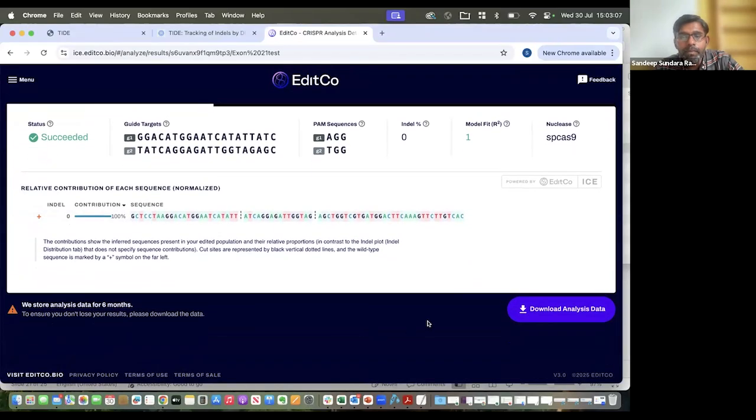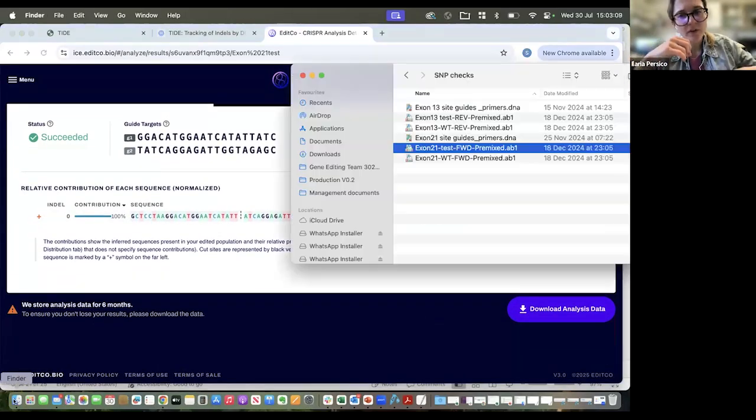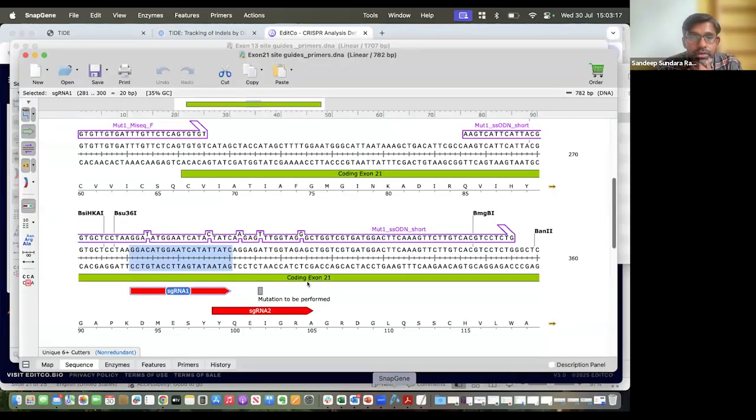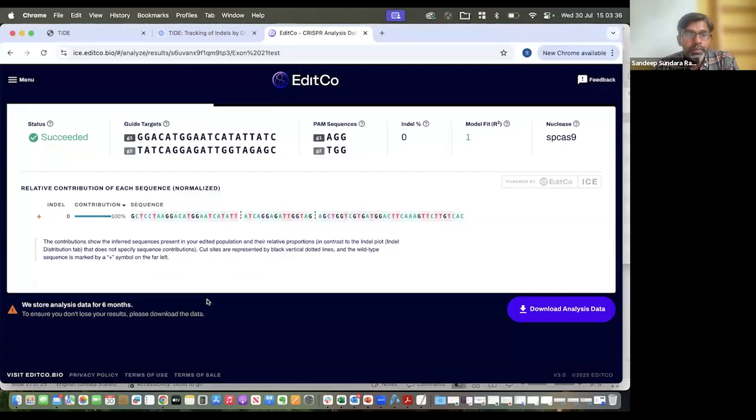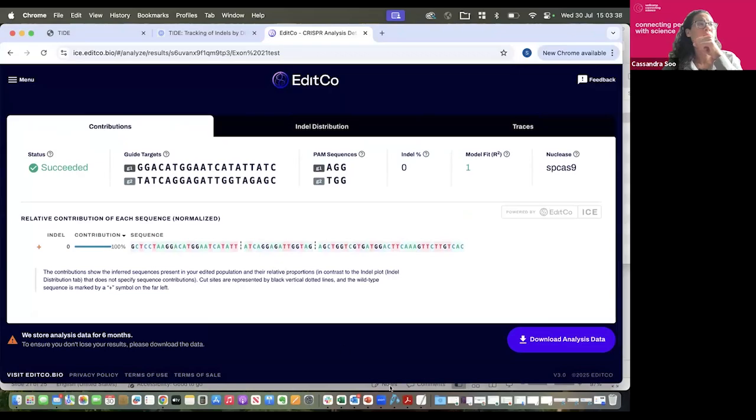Which is the donor sequence that we have to insert? Oh, the donor sequence. Sorry, the donor sequence is the purple sequence, which is a single strand oligonucleotide donor that is short in here. That's what you would need to insert. So just to clarify, that is a SnapGene file, correct? Yeah, those are SnapGene files.